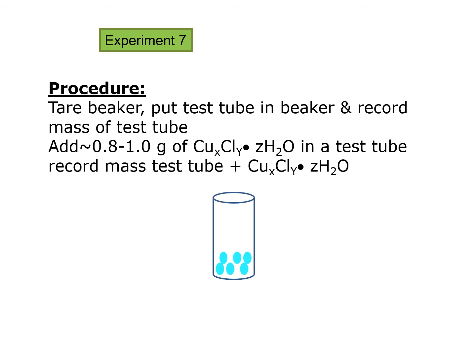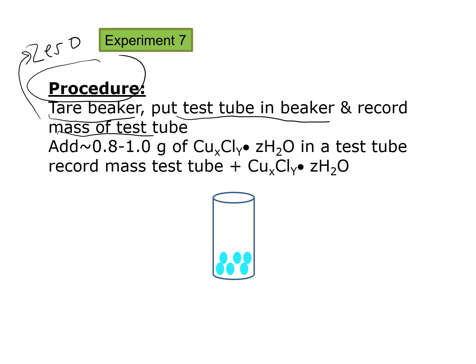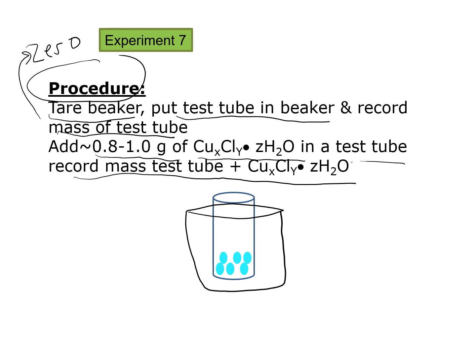The procedure for experiment 7 is as follows. First, tare a beaker on your scale — push the zero or tare button to subtract the beaker's mass. Then place a test tube inside the beaker and record the mass of the test tube. Next, add between 0.8 to 1 gram of copper chloride hydrate into the test tube and record the mass of the test tube plus the copper chloride.